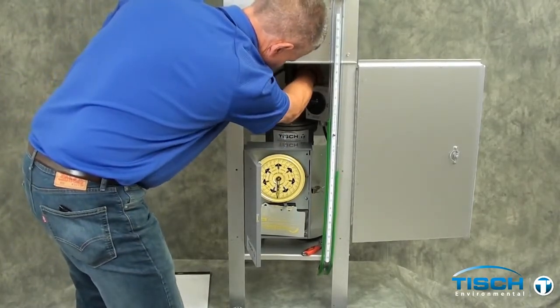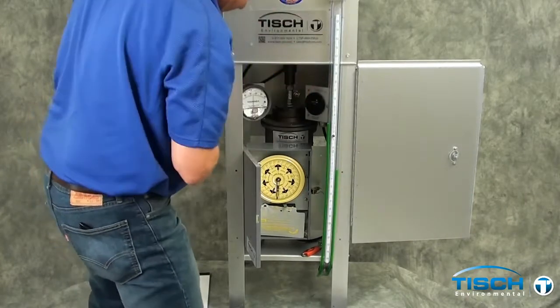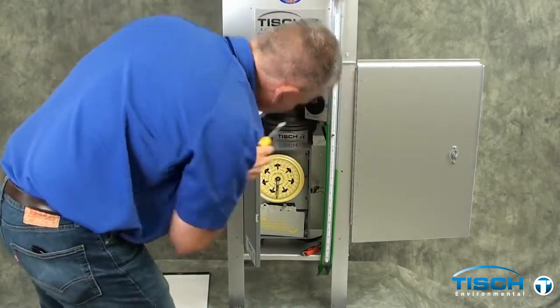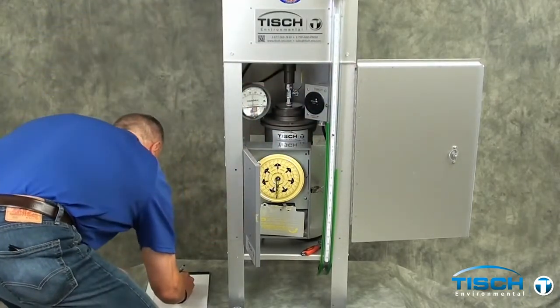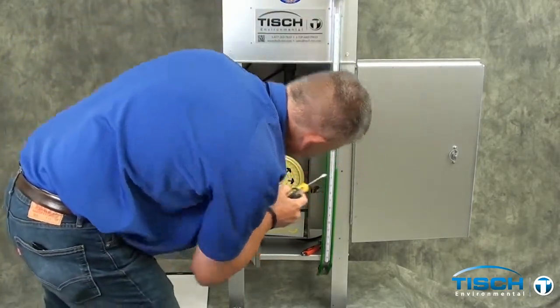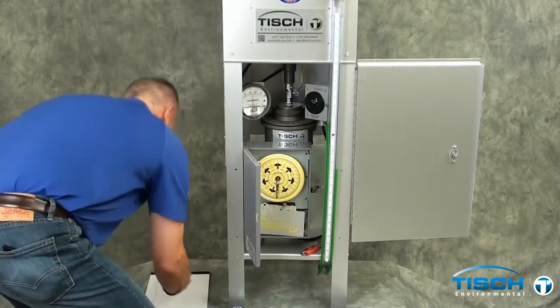Move the ball valve away from you again to obtain a reading of 50 inches on the magne-helic gauge. Then read the manometer as before — it went up 3.0 and down 2.9 inches for a total of 5.9 inches.